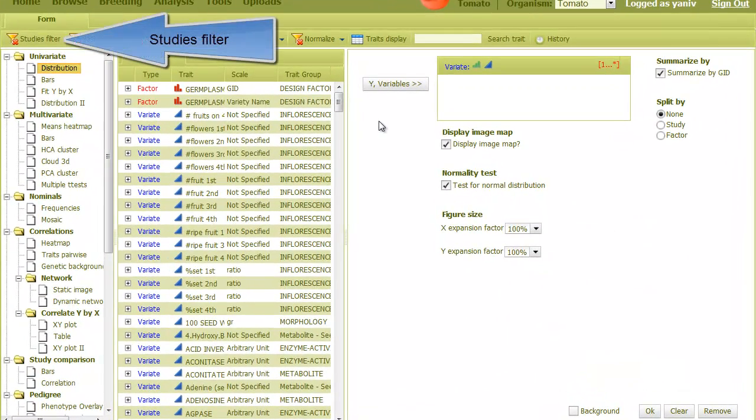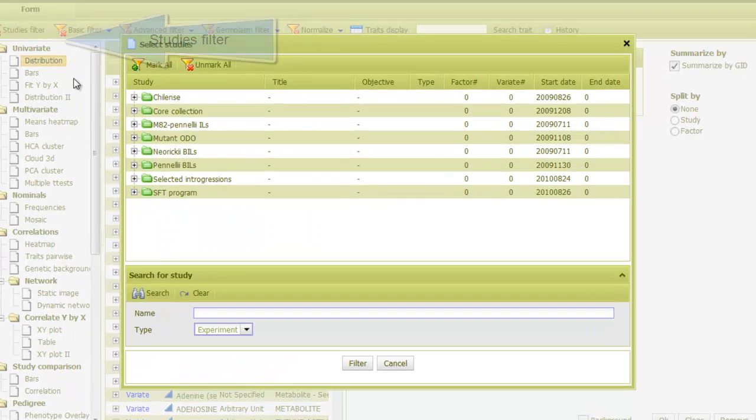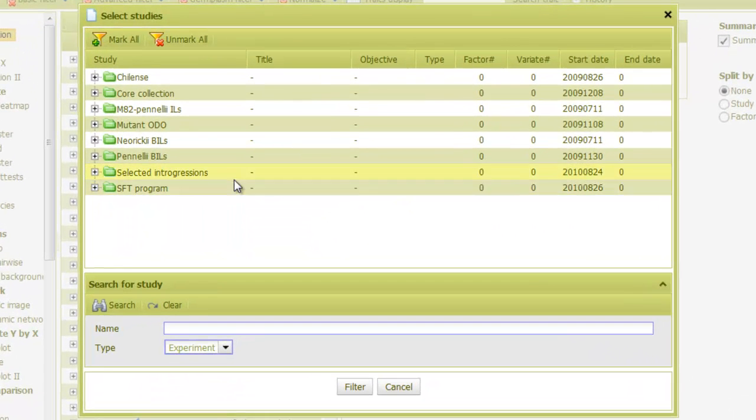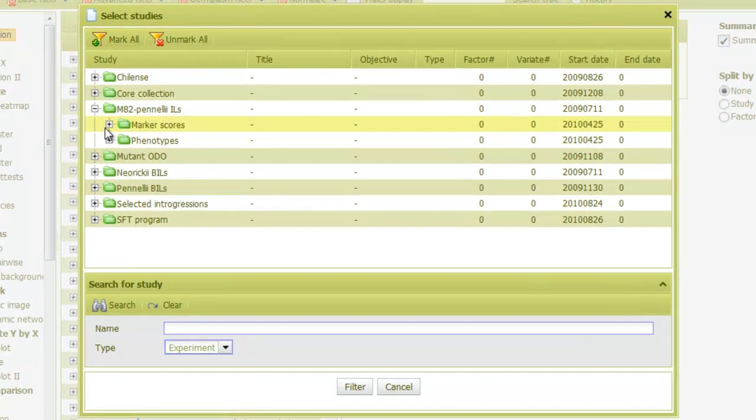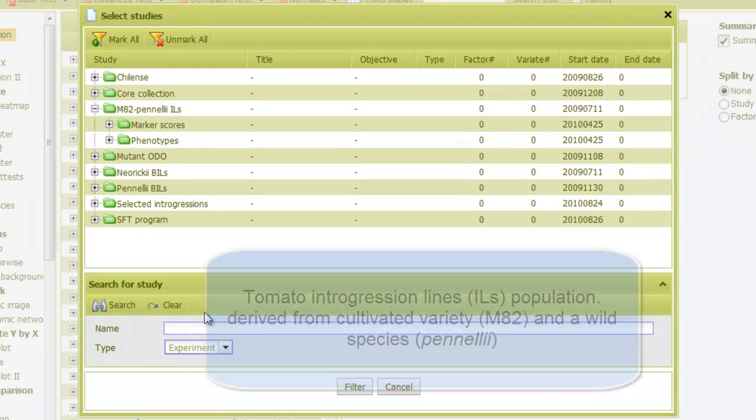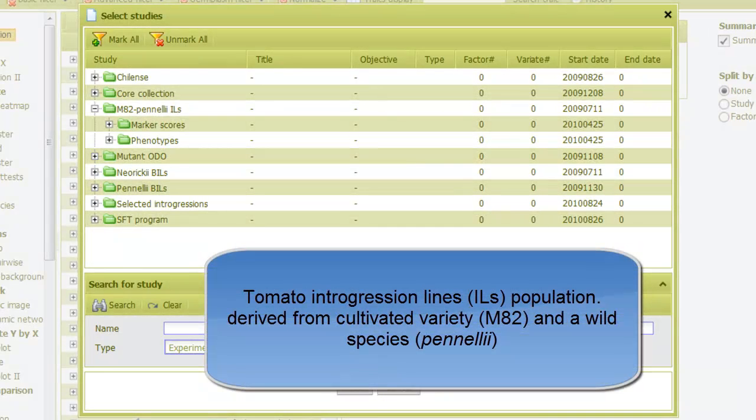From the analysis page, I go to studies filter to select the studies I want to analyze. In this example, I'll use data measured on a tomato introgression lines population that is derived from the cultivated variety M82 and the wild species Pennellii.